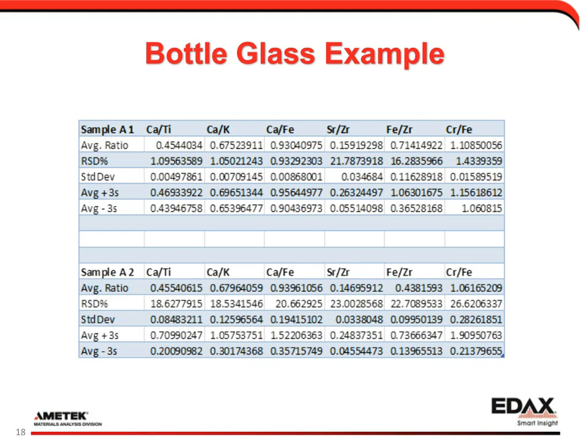So in that instance, I replaced it and used chrome ratioed against iron. The reasoning was that they are very close to each other in atomic number, which generally makes them good for ratioing, as it minimizes takeoff effects, which are more substantial as the atomic number spreads between the two elements.